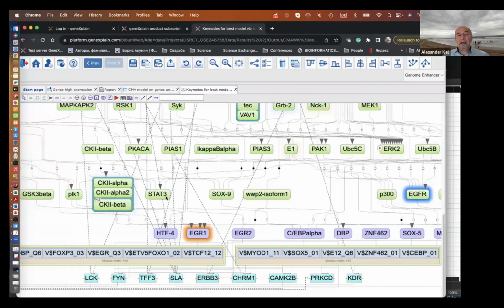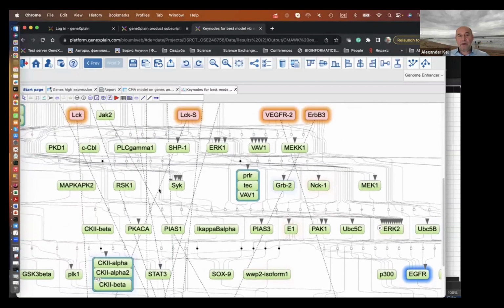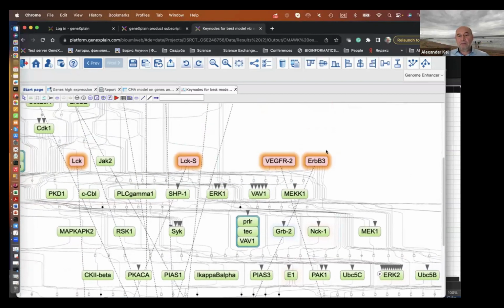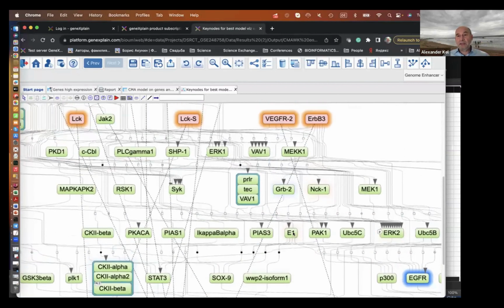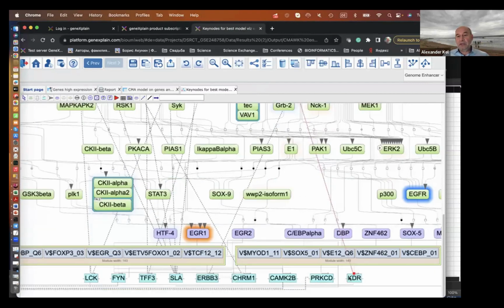And then the next step is searching for master regulators, which means we're going into our network of interactions from TransPath, and we start going upstream to find which of the proteins in the system, which of the signal transduction proteins like kinases, receptors, ligands, are connected to those transcription factors on one side, and also are encoded by the genes which are regulated by these factors.